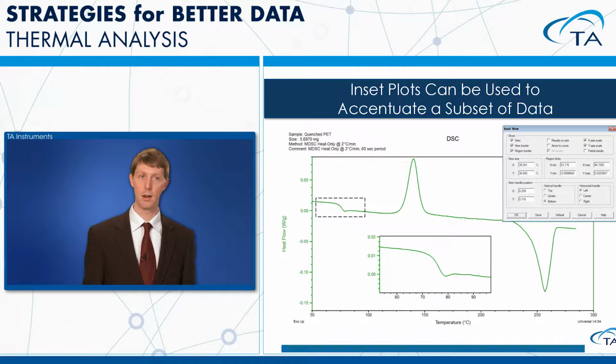Now, obviously, you've got a variety of other options to format that curve, whether you want analyses to show up on the inset portion or just on the curve itself, or if you want borders and arrows and so forth. So there are quite a few options, but the power here is really being able to zoom in on something or pull something out of your data set and present that to someone effectively.